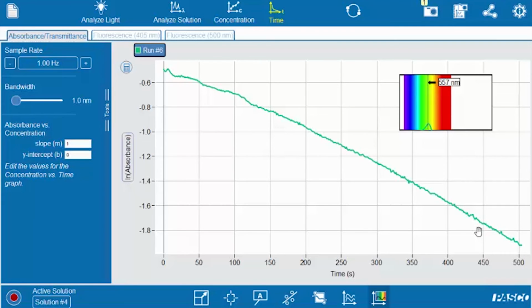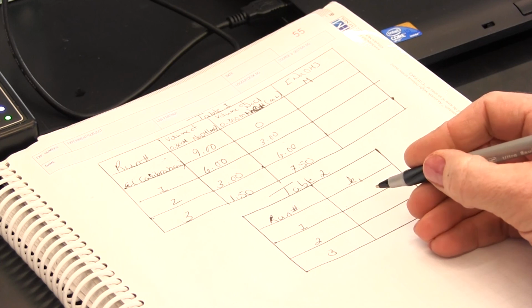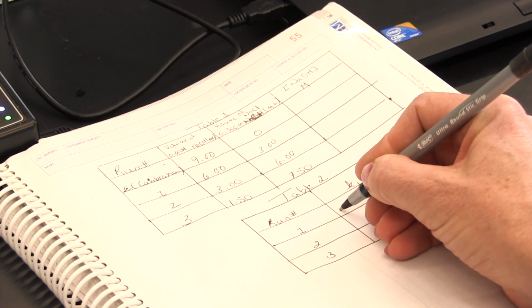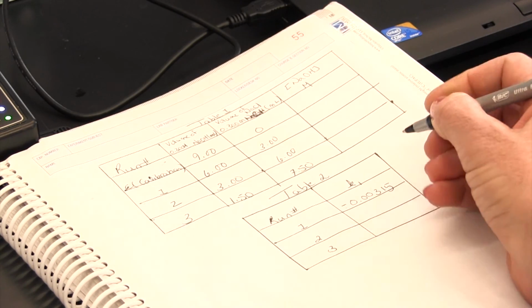So at this point, what I want to do is use my selection tool here to highlight the absorbances which range from 0.4 to 0.15. And on a natural log scale, that's from about negative 0.9 to negative 1.9, which is down here. And then I will use my linear fit button. I have to move this out of my way to show that best fit line. So now I want to record the value of that slope in my notebook. So that is m, so it's negative 0.00315.